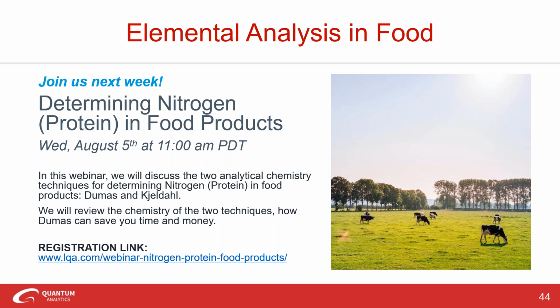Well, okay, yeah. I've seen some studies where even energy dispersive XRF systems are being used for breeding programs. But this question again is that sensitivity gotcha, right? If the limit of detection is a trace level, like parts per billion, then you're better off with another technique, right? But if you're working from parts per million up to low weight percent even, yeah, sure, this is manageable. But now for the accuracy results, again, these are considerations that we have to take in.